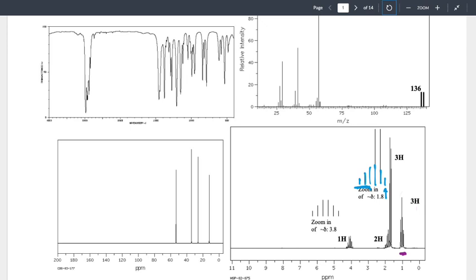Okay. What we have now just done is 80% of the question. As exciting or depressing as that may be. Right? Because what we have now processed through is all forms of spectroscopy. Everything written out would get you full credit. The last part is now putting all the pieces together. As I said kind of already, you could have figured out the answer without looking at all the multiplicity, but I want to look at the multiplicity. Let's look at the hard way to do this.